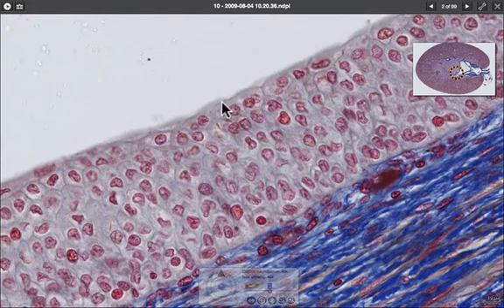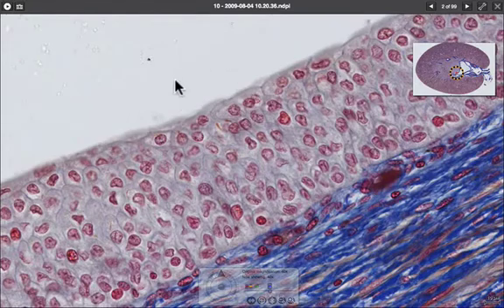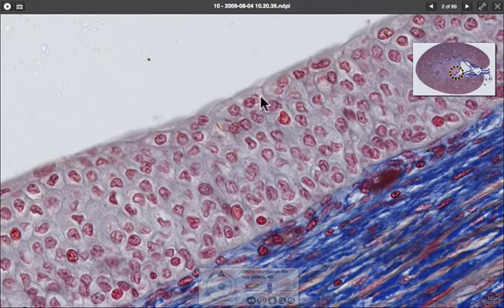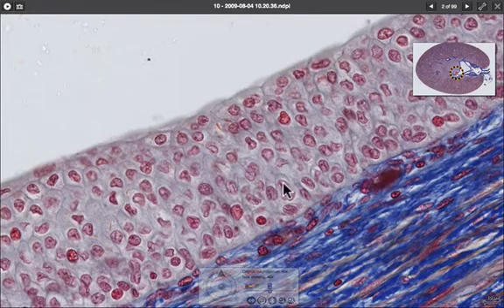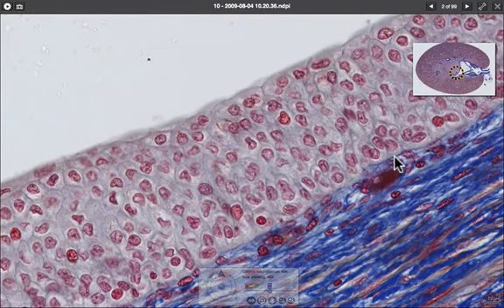As this epithelium stretches when the tube is filled, the cells become quite squamous, and when the tube is relaxed they are much more dome-like and rounded. The basement membrane sits along this level here.